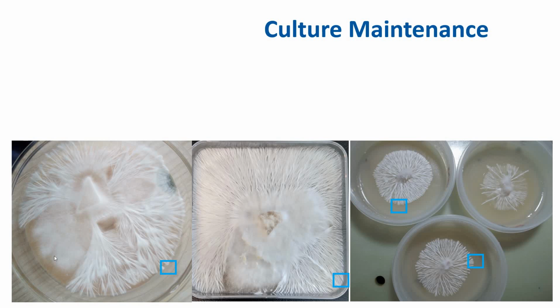So in this first agar plate right here, notice this is too big of a piece, right? You don't want to ever transfer this big of a piece of agar, because there's a chance you could get contamination. So consider taking a small tip of it, right? And you see this is penicillium, a fungal contamination, and this is sectoring right here. This section is most likely sectoring or possibly a contamination, but most likely sectoring.